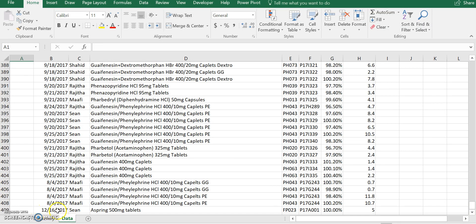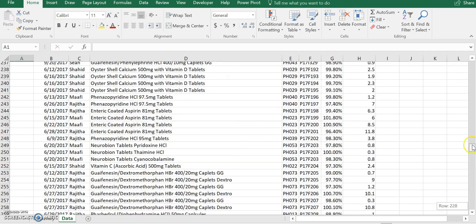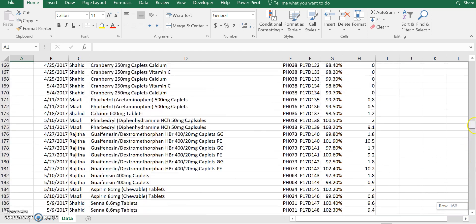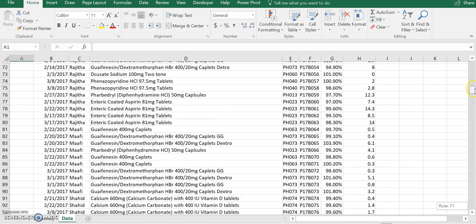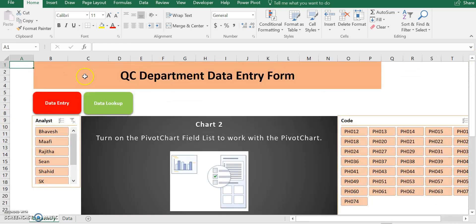2017, December 16th. So it's me, analyst is me, the product description is here, product code, lot number, percent purity, which is assay, and average variation. Everything is entered, so it works. Now you can go back by clicking the return button. It will direct you back to the first page.